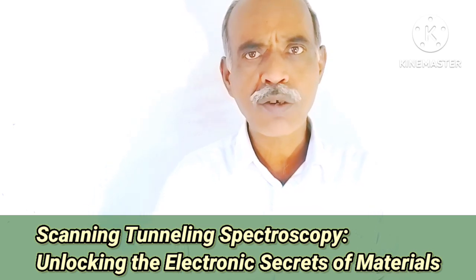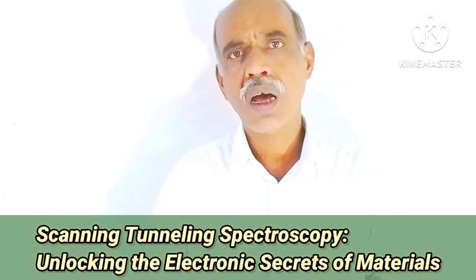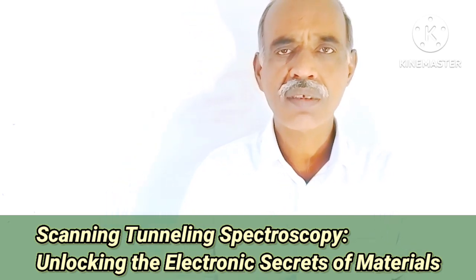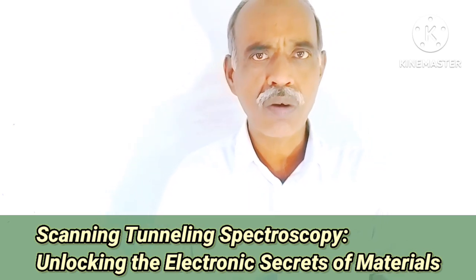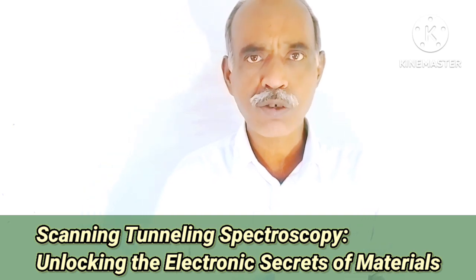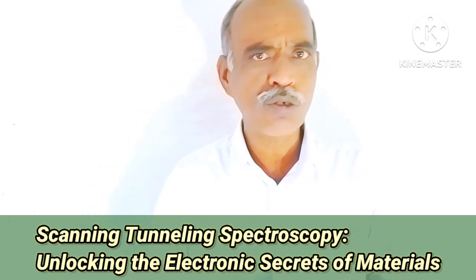Scanning Tunneling Spectroscopy. Last day one video was posted on the same channel. The name of the technology was STM, that is Scanning Tunneling Microscopy. And today we are talking about STS, that is Scanning Tunneling Spectroscopy. So from microscopy to spectroscopy.